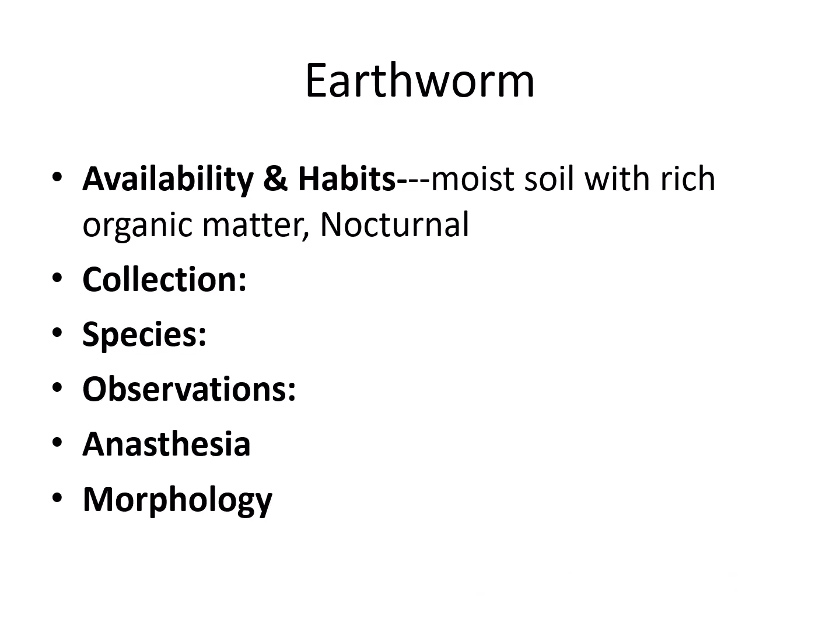As far as the availability of the earthworm is concerned, it is present all over the world, and they prefer moist soils with rich organic matter. The soil should not be dry and sandy, and they are mostly nocturnal. They are active at night, so their collection is very easy.